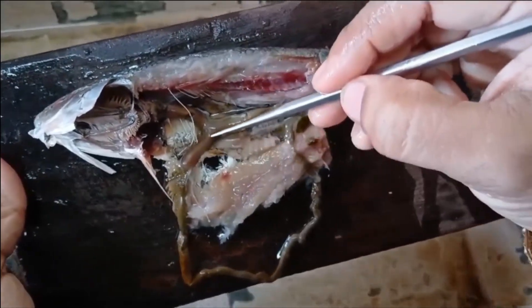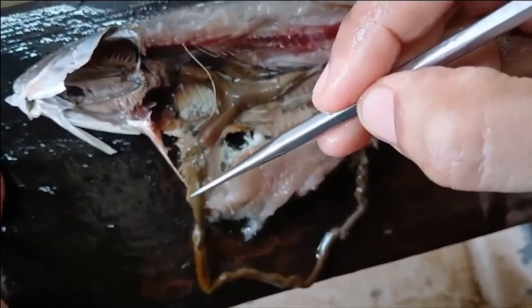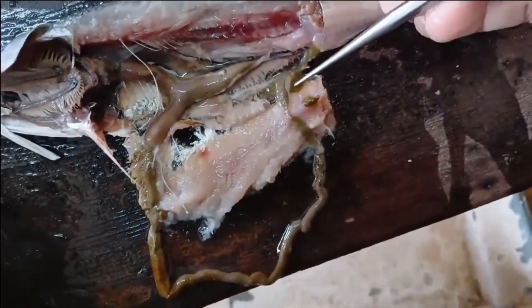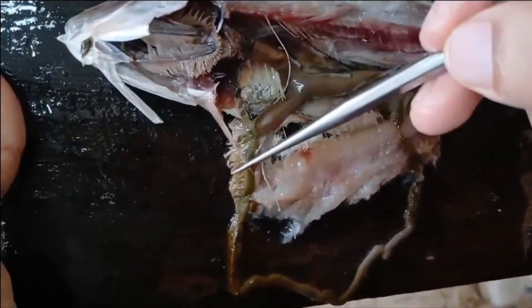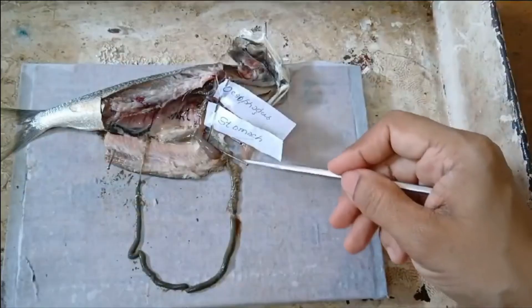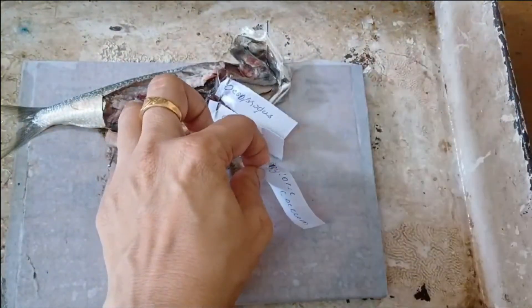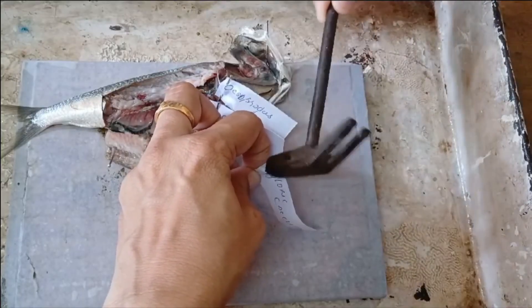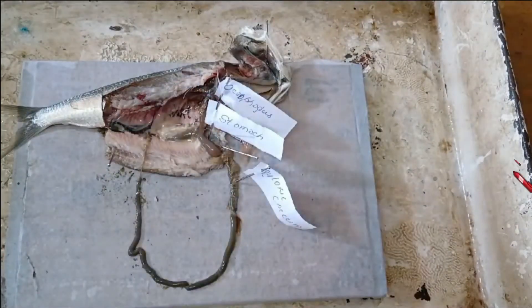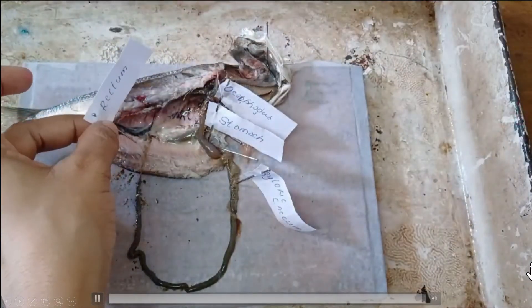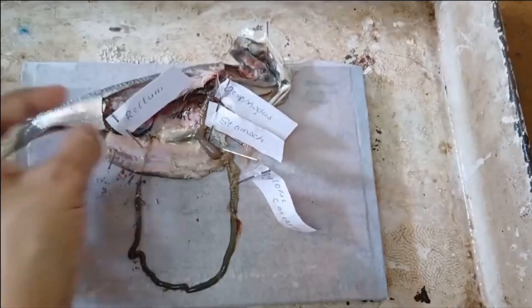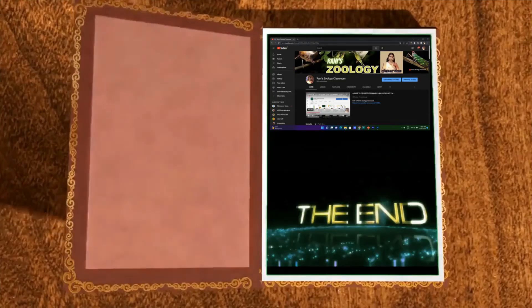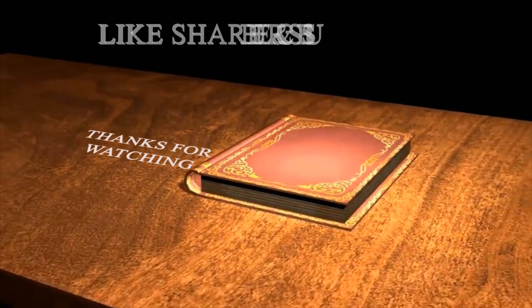This is another specimen of the fish I prepared in parallel, thinking that if somehow I broke the alimentary canal on the first one, I could use this. Now I am showing this to have a look at all the other portions of the alimentary canal. We are labeling all the parts — esophagus, stomach, pyloric caeca, the remaining intestine, and finally it ends in the rectum. While pinning, make sure not to pierce any stomach or any region of the alimentary canal. We have done — thank you.